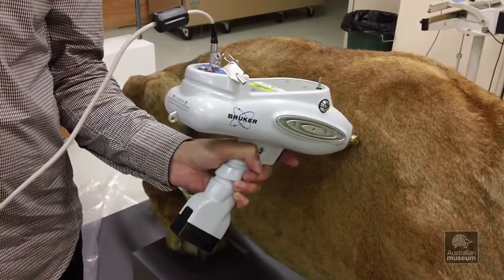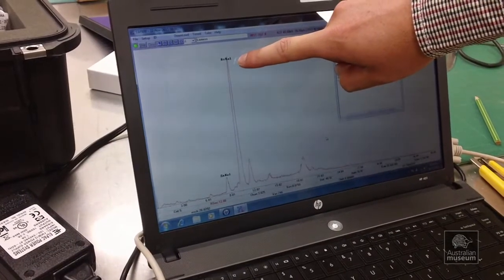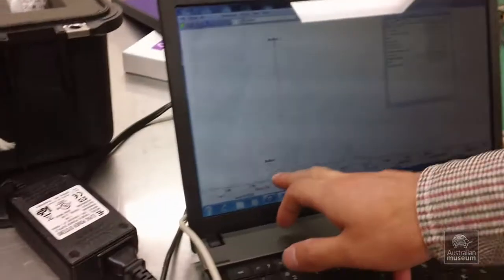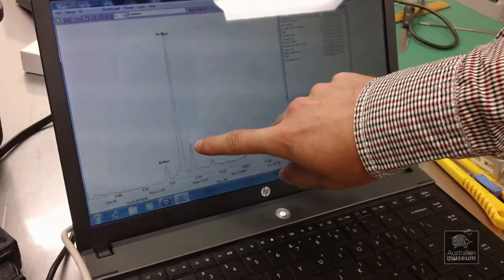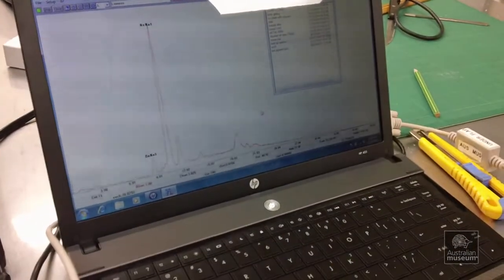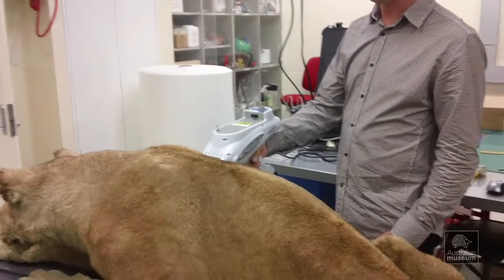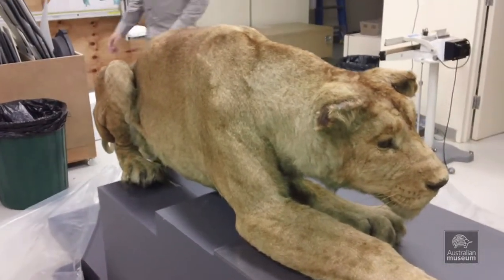So that's an arsenic peak — we have a very clear indication that arsenic was used to prepare the specimen. Other elements it's picking up are zinc, and possibly iron from the armature inside the animal. It really is just a quick 30-second reading and it will indicate whether there's arsenic in a specimen.